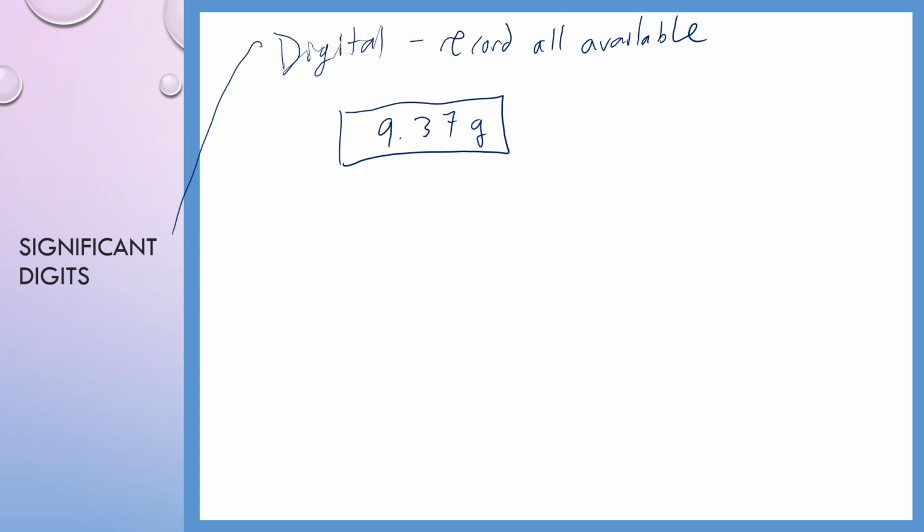Or a digital thermometer, you want to record, let's see if I can draw a decent one. It's a temperature probe, digital thermometer. Whatever the temperature, you want to record all of the available digits.